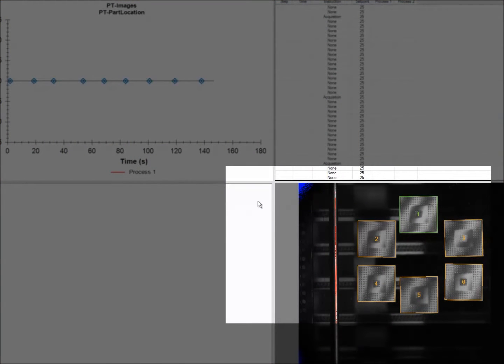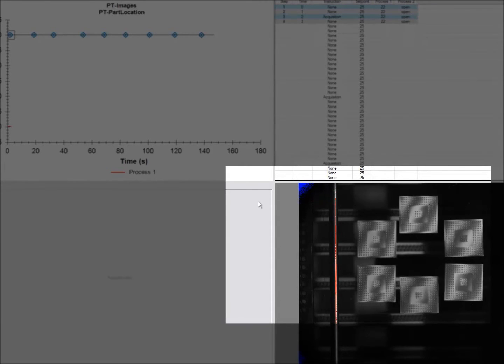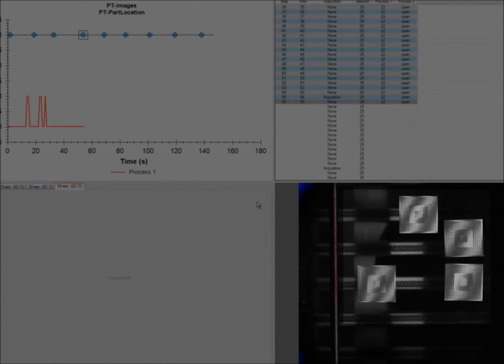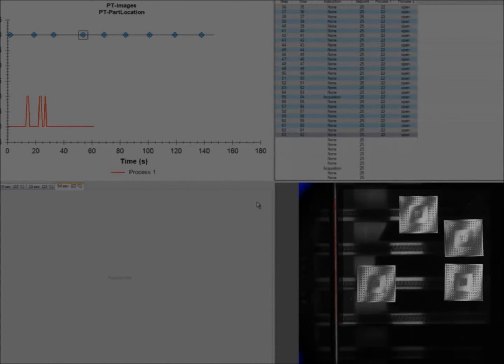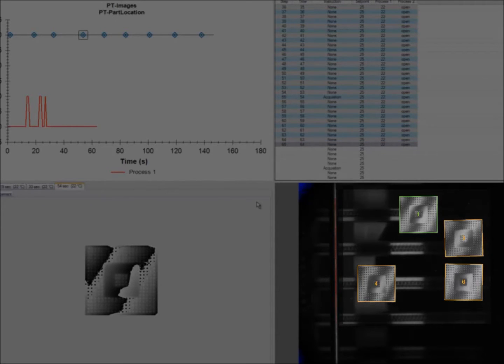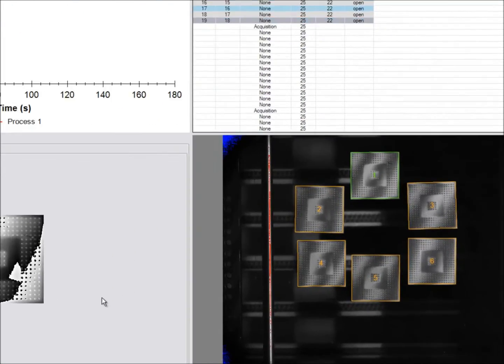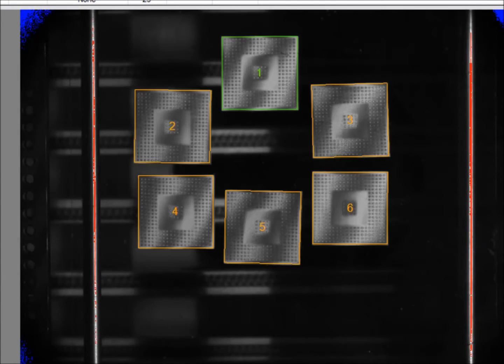Part numbering is established in the initial part tracking check taken before the profile is started. If we were to completely remove a couple of samples from the camera window, then the remaining samples would still be correctly named in the following surface measurement. Excluding a part from the tracked set of parts may lead to extra processing time, but suddenly calling Part 5 Part Number 6 is something that must be avoided. Some examples of how much movement is tolerated are shown as Part Number 5 is moved between different measurements.